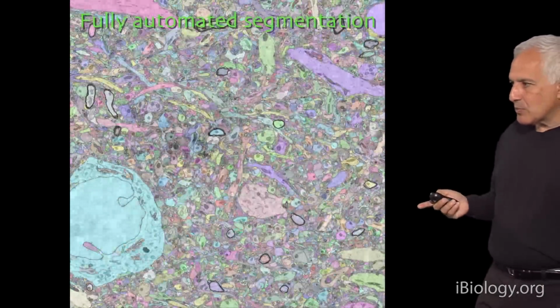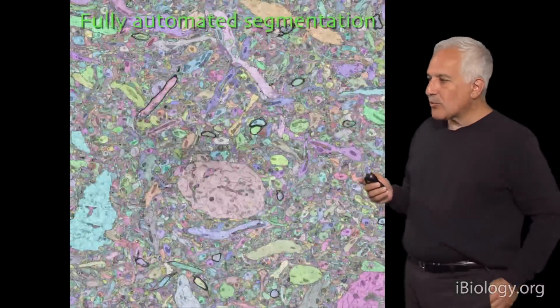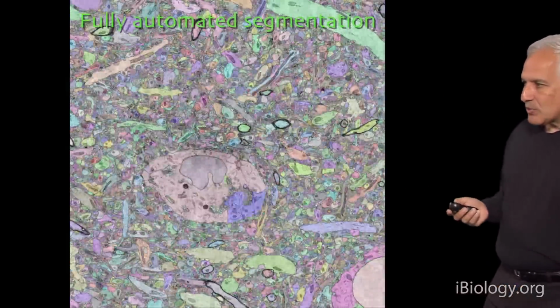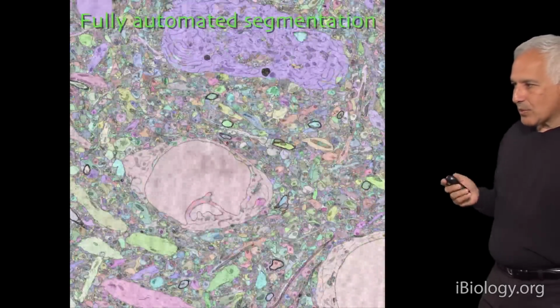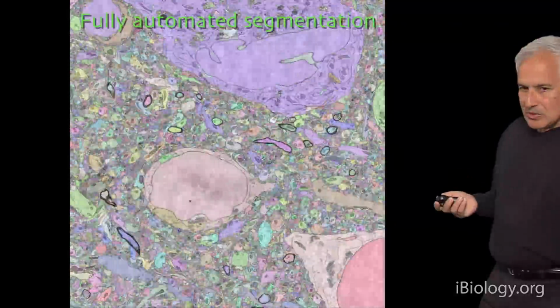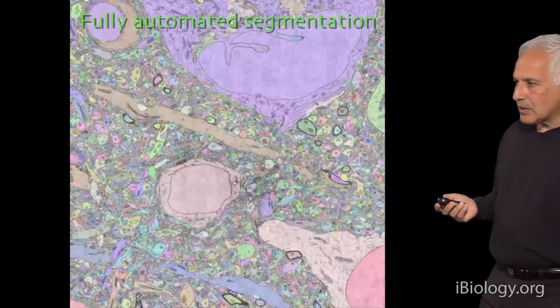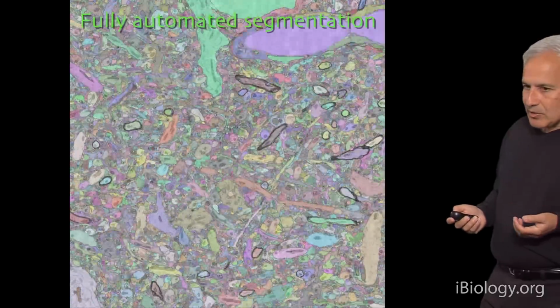If you look carefully at this movie, you might find an object that changes color. If it does, the algorithm failed us. It means it got confused. Most recently, there are parts of the brain where you really have to look hard to find any errors at all. But we think this is the future for this kind of analysis, to do this without humans doing a lot of tracing.